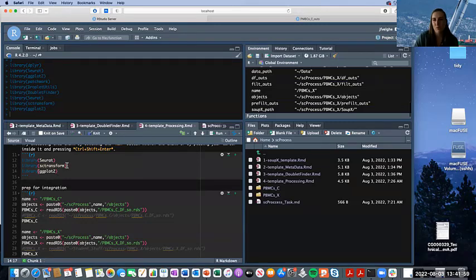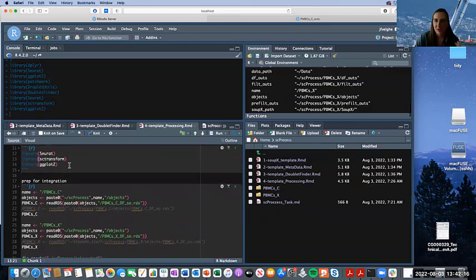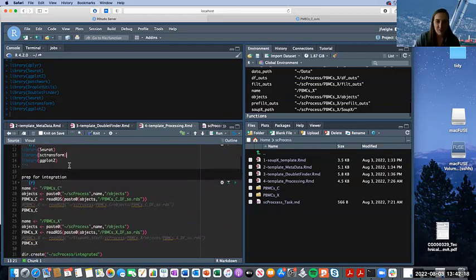And there is an SC-transform 2 as well. So this is the part where you're scaling and normalizing, centering your data. So it is an important step. So I do suggest using SC-transform over the typical Seurat process. This is like the one time I'll actually advocate for something. But of course, there's other ways to do this as well. And so if there's something that works better, go for it. I like SC-transform and I'm the advocate for it. So we're going to use it.